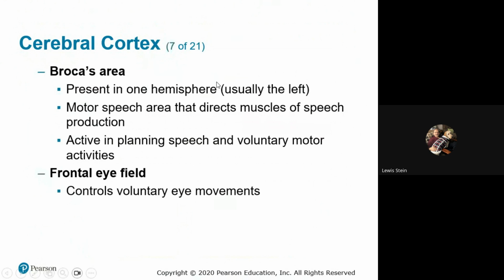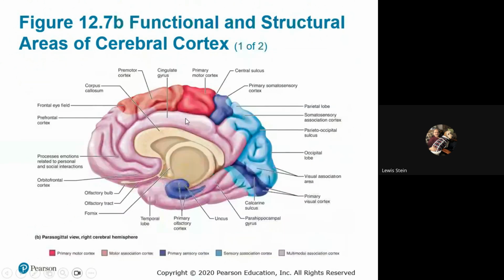And again, this is more premotor, Broca's, frontal eye fields. You're going to do a variant of this when we see the internal areas. This is really important: white matter is something that's going to be very visible. This very, very thick piece of white matter, generally almost all dissections do this: you take that sagittal fissure, right down that sagittal area where you saw the suture area, and if you go straight down and open it up with your fingertips, you'll be able to see a white, relatively distinctive structure.